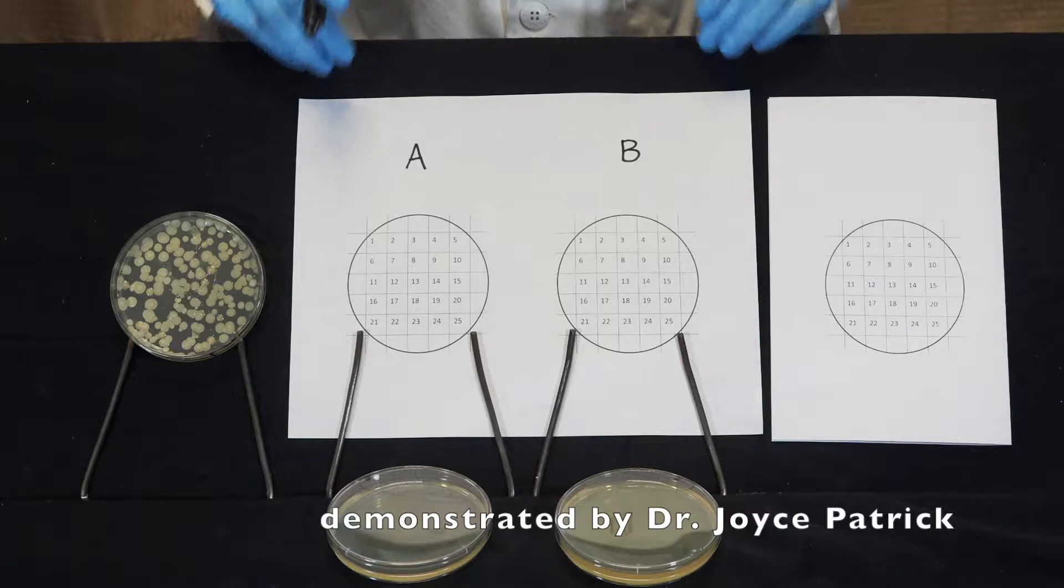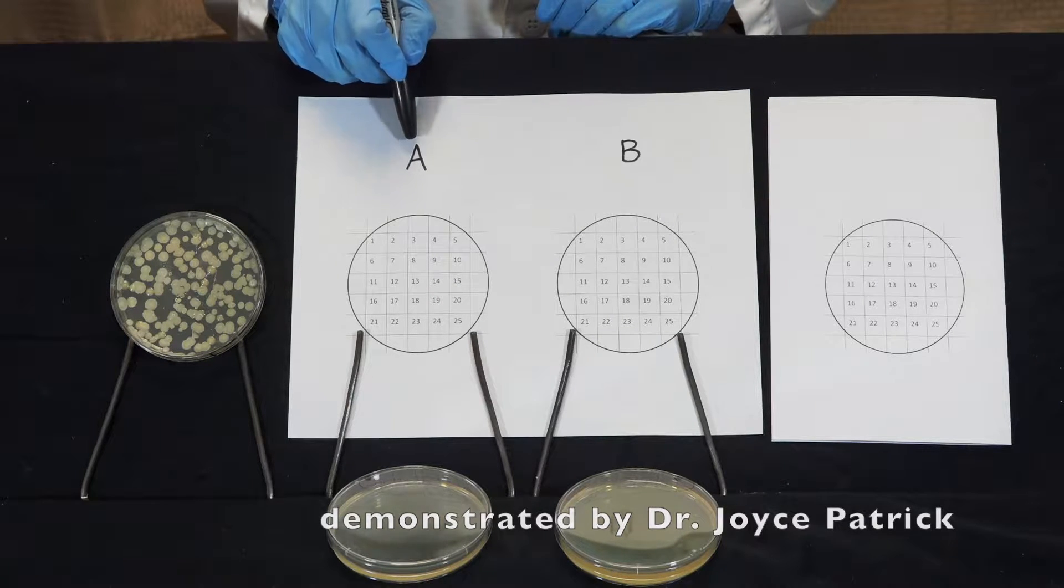This is our replica plating grid. We have space for two plates, plate A and plate B.